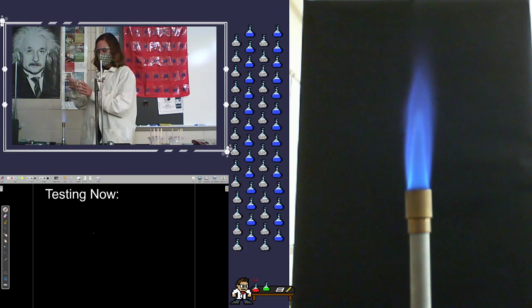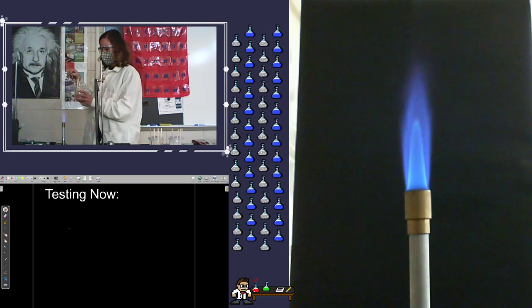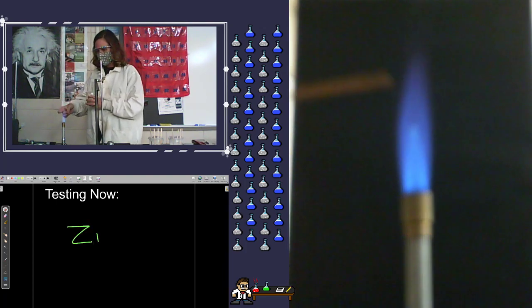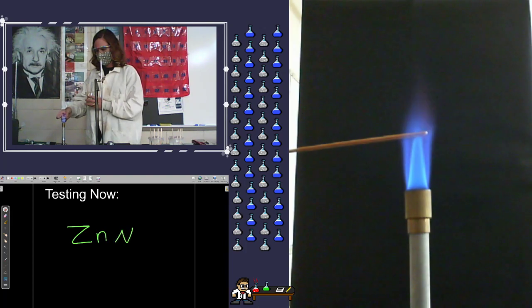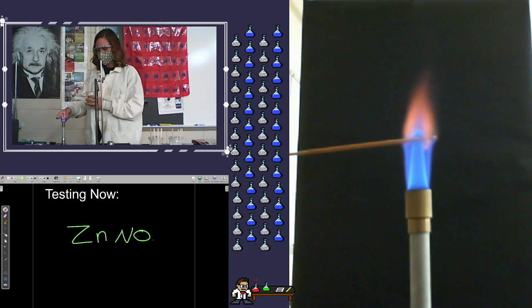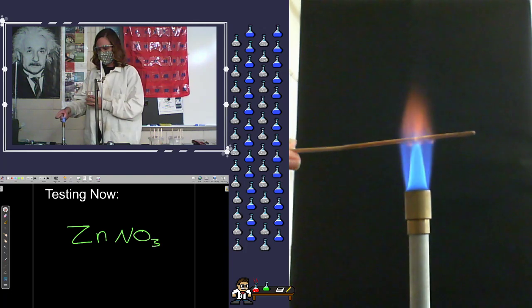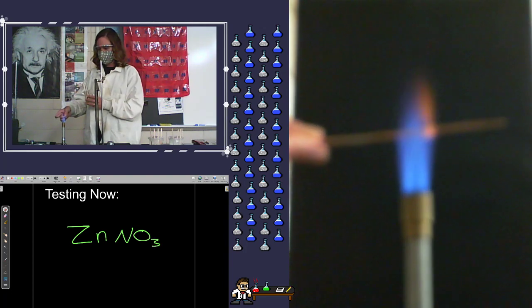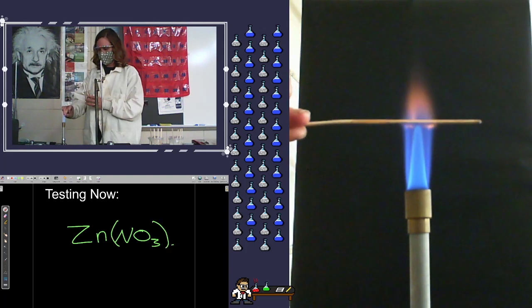All right, our next one, we have some zinc nitrate. We can get this one going. There we go. And I always forget, is it ZnNO3 or Zn(NO3)2? I always forget. Two. Zinc always has a positive two charge.